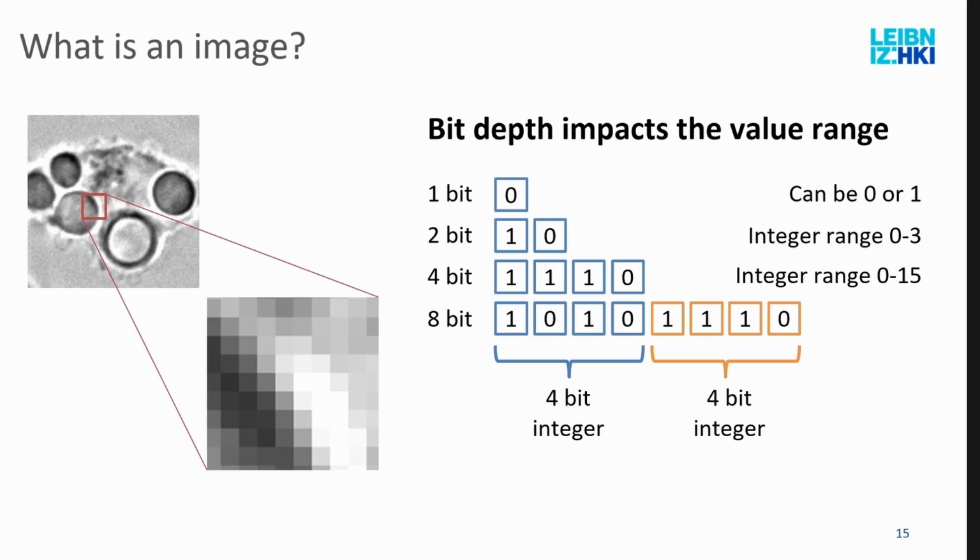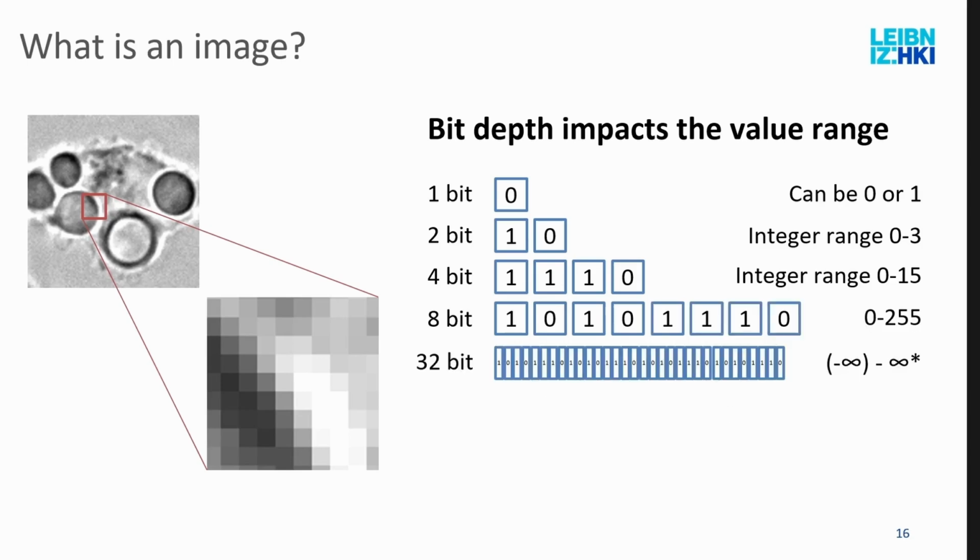But this is not so simple either. You can also say, and the computer will do this for you if you set this up correctly, it's not your concern, it's the concern of the developer that develops the image analysis tool. They can say, if you have 8-bit space in this pixel, I can split this up virtually into 2 4-bits. In this way, we can store 2 numbers within these 8 bits. We have a different interpretation of the pure storage in bits that is available.